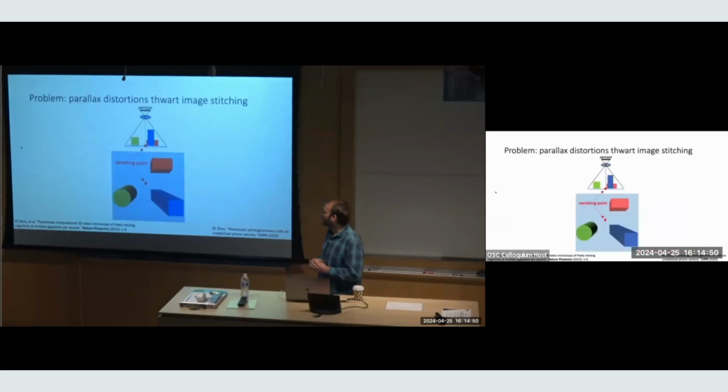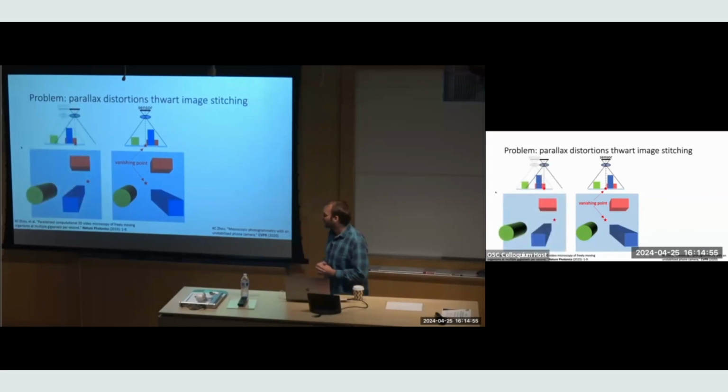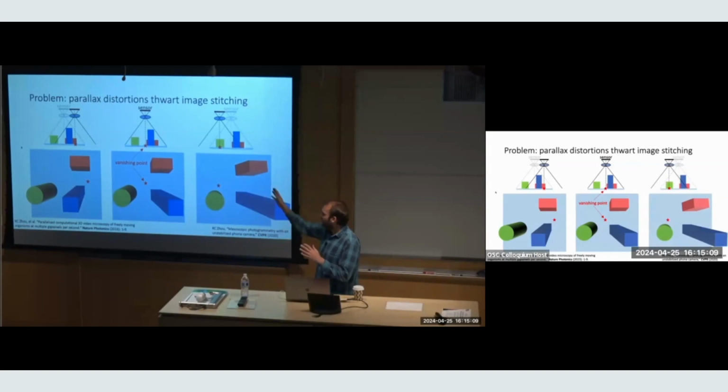Okay, and so the way this works is we take a picture with one camera, and there's a vanishing point that I'm just keeping as stationary, right? And so if we shift the camera over to the right, you'll then take a second picture, right, where everything's shifted. Sorry, we're not really shifting the camera, we're just imaging from different micro cameras. If we image from the micro camera on the left, we'll see this picture, right? So these are 3 pictures we capture of a particular scene, and our goal is to stitch them together and estimate the 3D height.